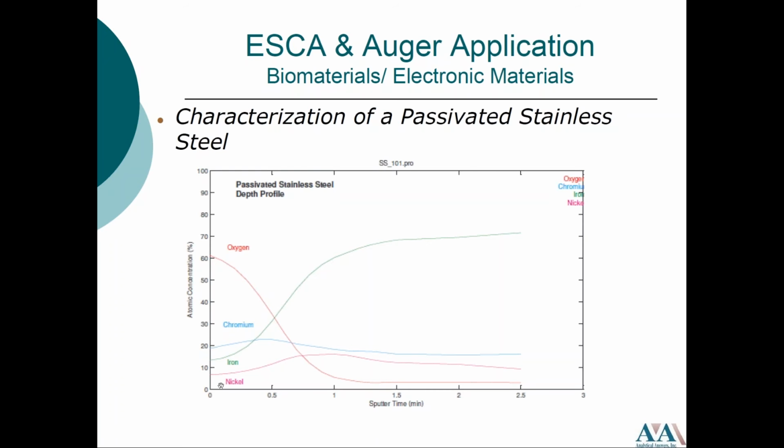Our first SAM application, or scanning Auger microanalysis, also known as Auger electron spectroscopy, has to do with thin films. What's suspected is the diffusion of the substrate into the above layer. Now here, SAM can also be combined with FIB.